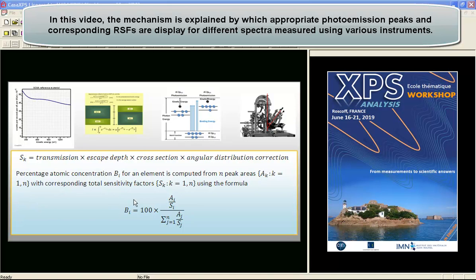Quantification requires peak areas to be calculated and then these peak areas are scaled by what is referred to as a total sensitivity factor. This total sensitivity factor is the product of the transmission response for an instrument which varies as a function of kinetic energy.